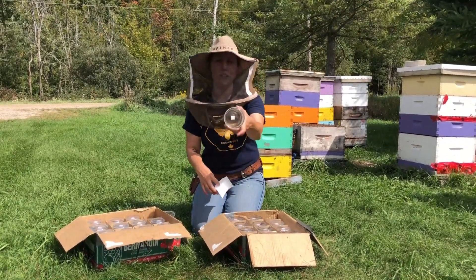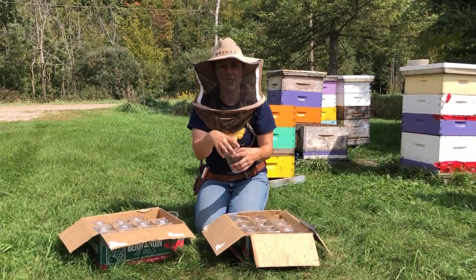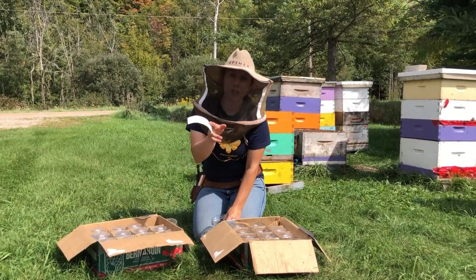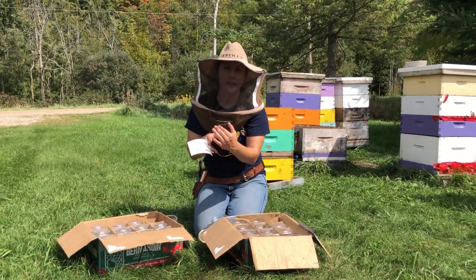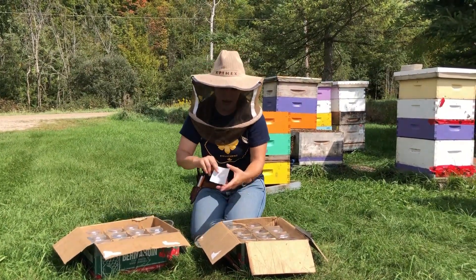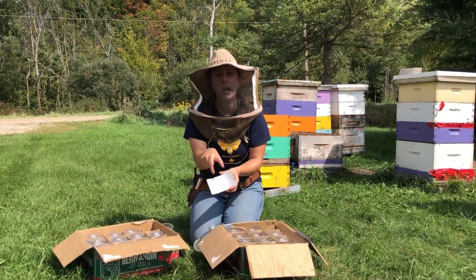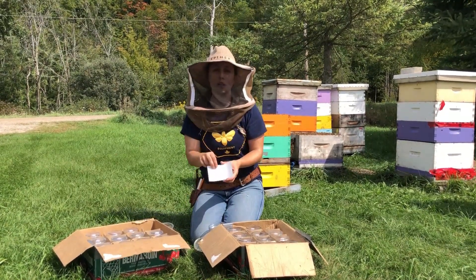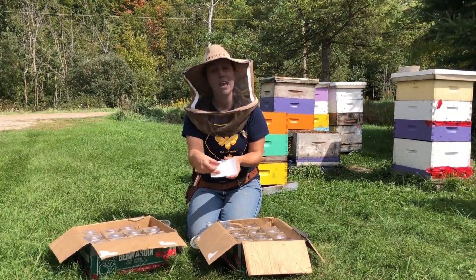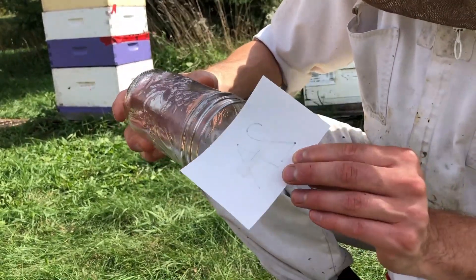Inside the jar you're going to have a little sugar cube glued to the very base of the jar. That's just to give the bees something to munch on while they're in there. Each one should have a cue card labeled so you know which colony you took the bees from. On each card, you're going to staple a little piece of strip. Today on the yard, we are testing the efficacy of Apivar, so this is a small section of an Apivar strip that's stapled to that cue card.